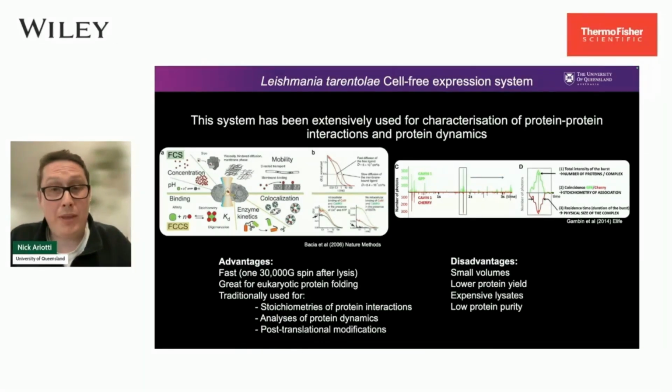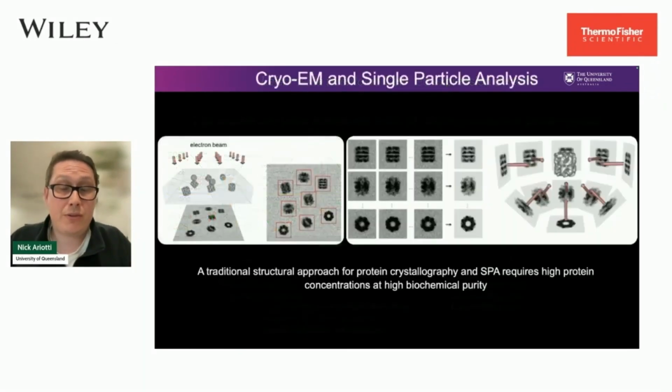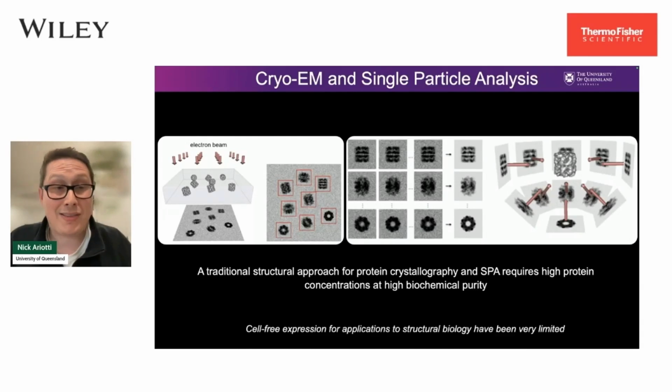So what do I mean by that? Well, this is what a traditional structural approach looks like. It's much easier to do these kinds of analyses on highly homogeneous preparations of proteins. And as such, cell-free expression and its application to structural biology have so far been reasonably limited.